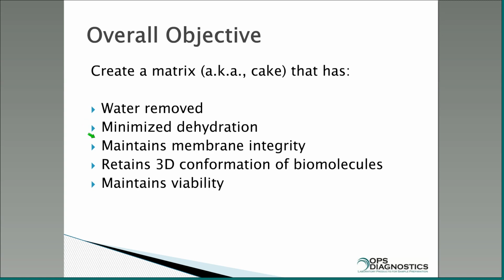Along with dehydration, you want to maintain the integrity of your membranes. You want to retain the 3D conformation of your biomolecules, and hopefully those two things together will allow you to maintain the viability of your organism.